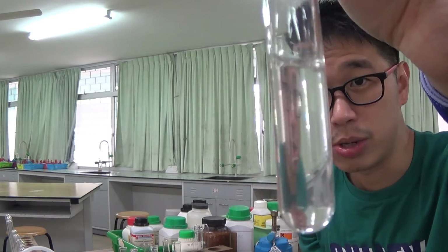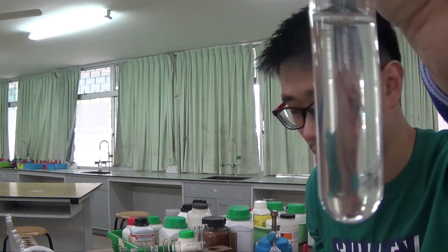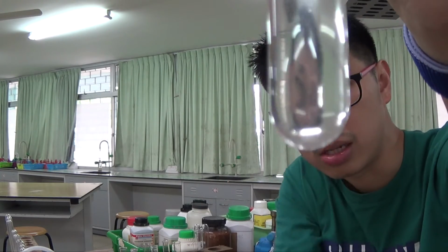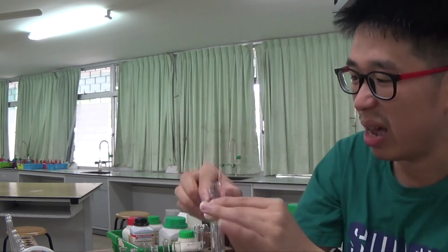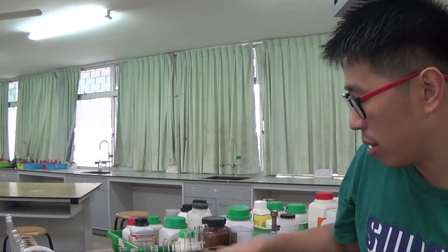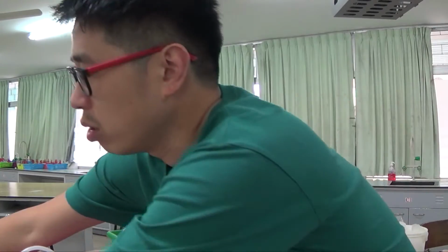Do you see how the precipitate actually goes away? Now it becomes clear again. You can see through. I hope you can see that it is clear. You can see my hand behind it. So aluminium 3+ gives you a hydroxide which is soluble.